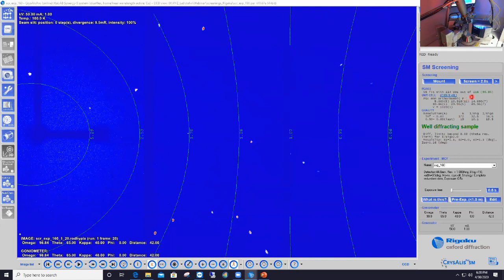Above that, you have reflection statistics showing you how many strong reflections were gathered throughout those 20 images, 116 here, and how many of these 116 were actually successfully indexed in that unit cell. So 114, which amounts to 98.3% of the reflections indexed. Obviously this is really good, but of course I chose a good crystal for this webinar. But don't get too hung up on these numbers, because at this point, indexing might still be wrong, and that's totally okay.